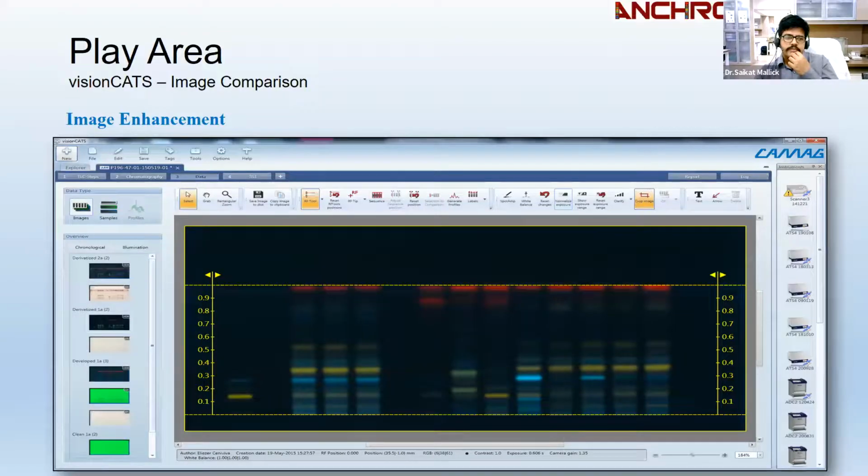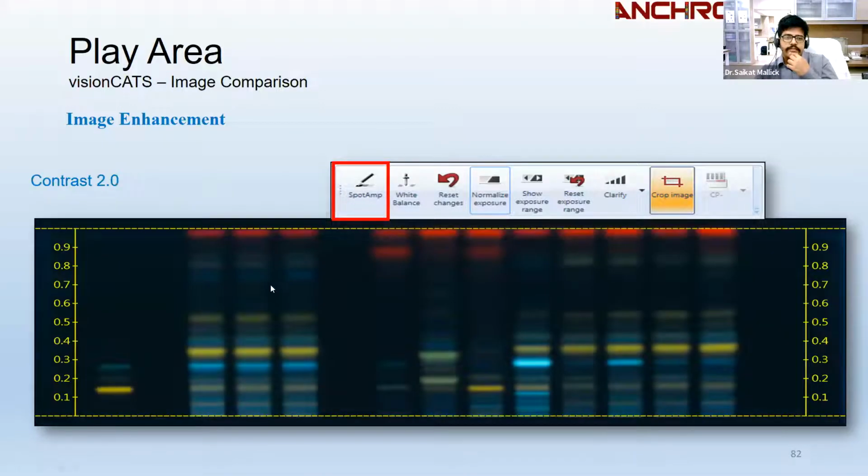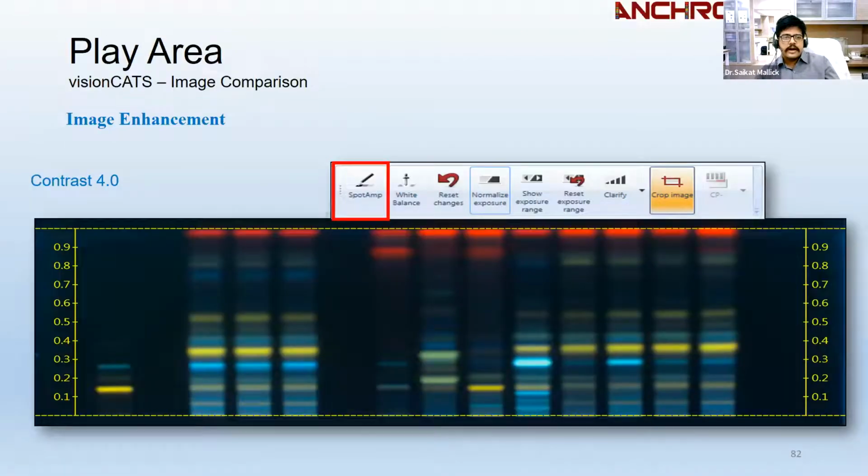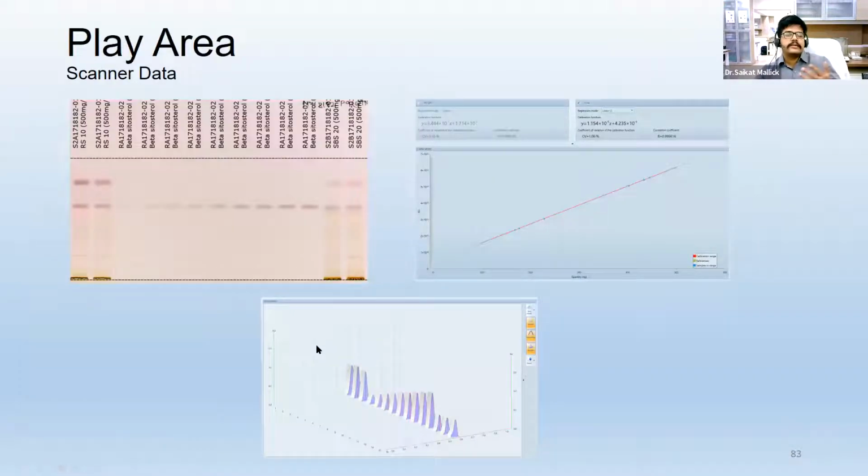Then these are some of the aspects where we can monitor even the faintest spots. Now here, if you see, by default, by the human eye, you are able to see like this, but you are not able to see any of the bright spots, faint spots. But with the help of image correction, even the faint spots are distinctly visible, and from that you can identify what is causing that response.